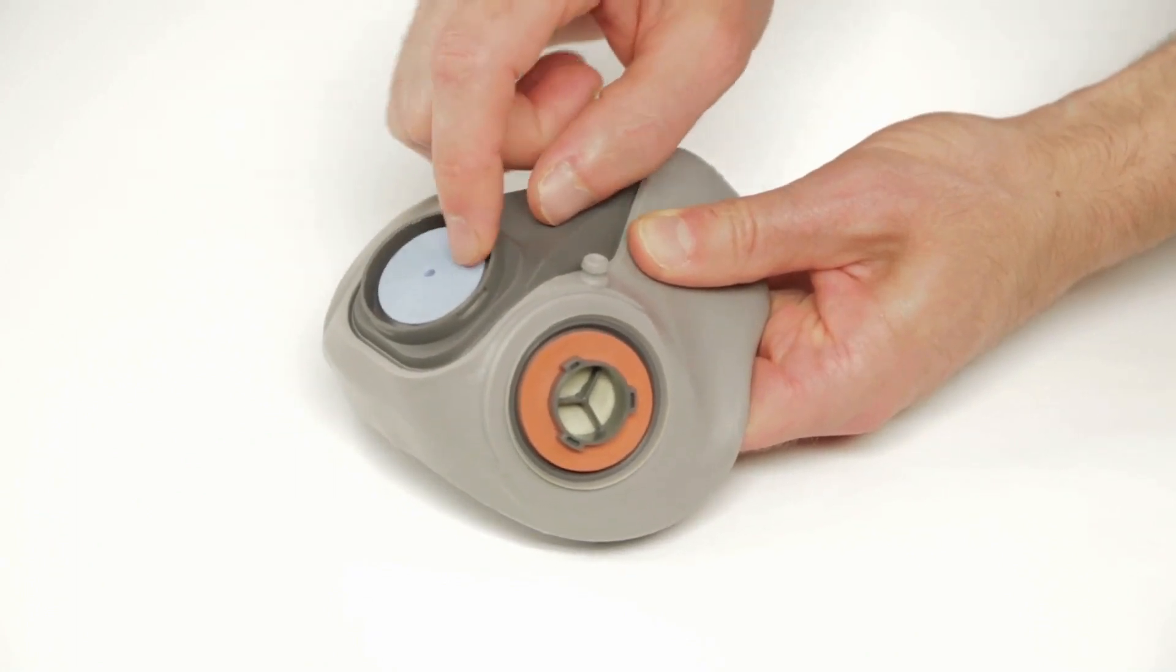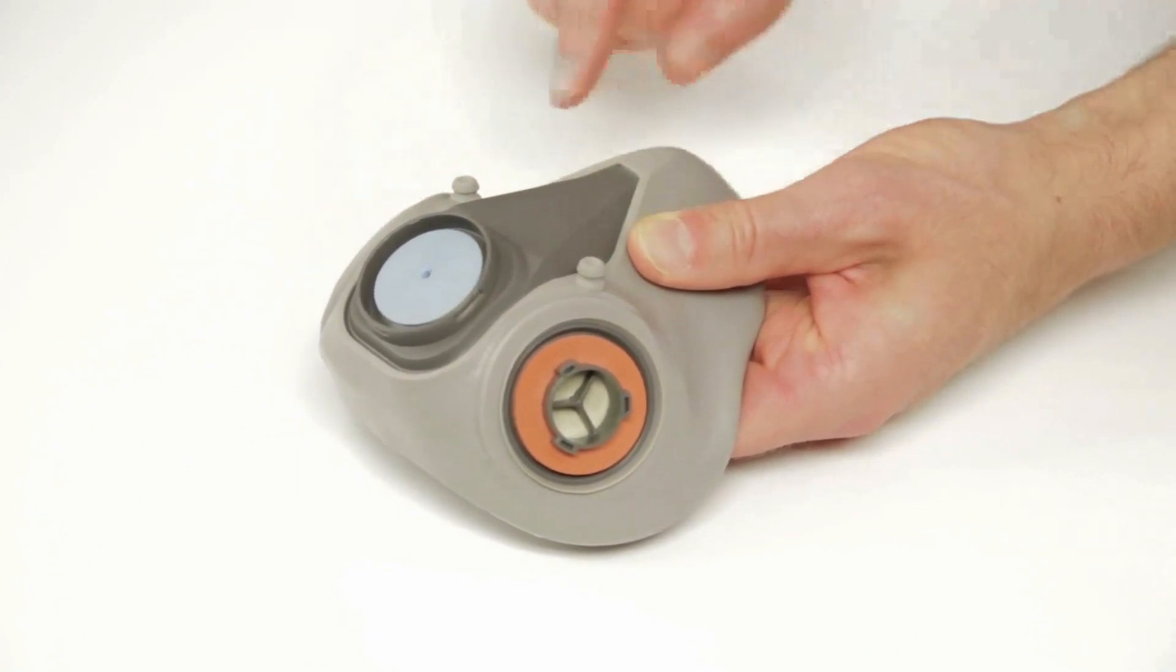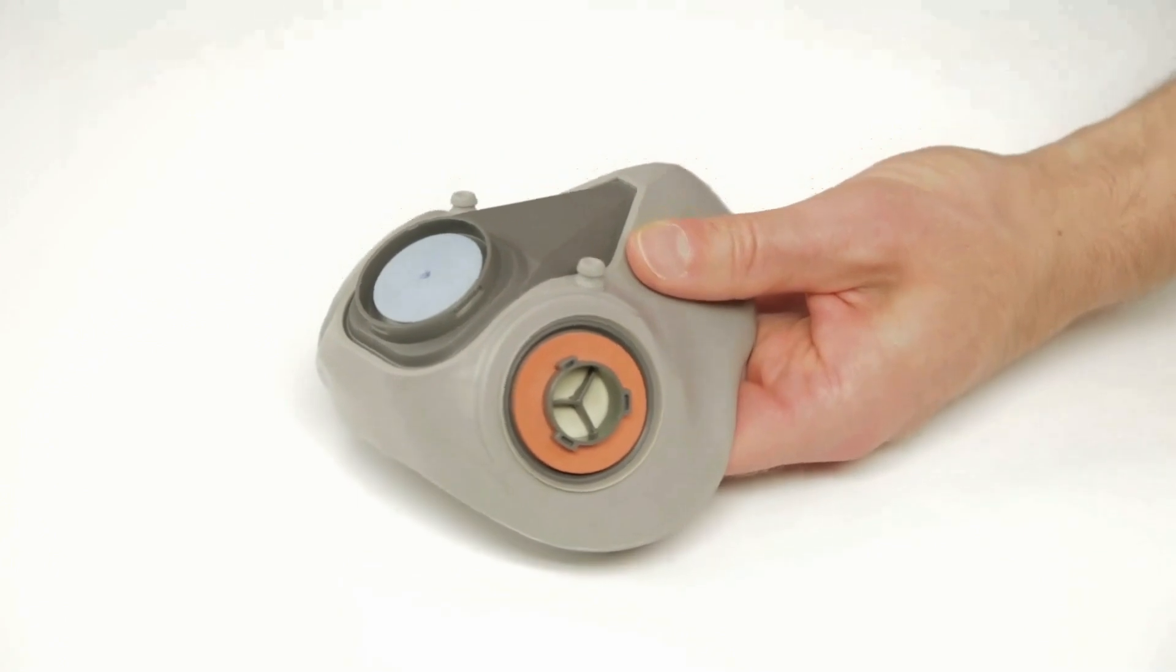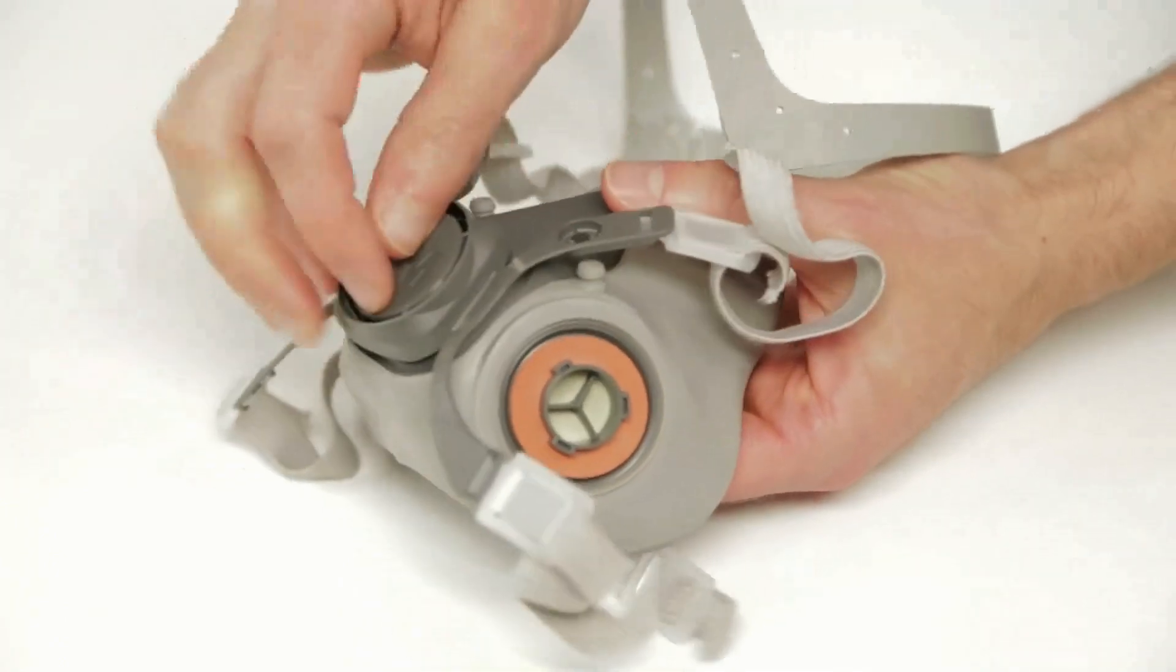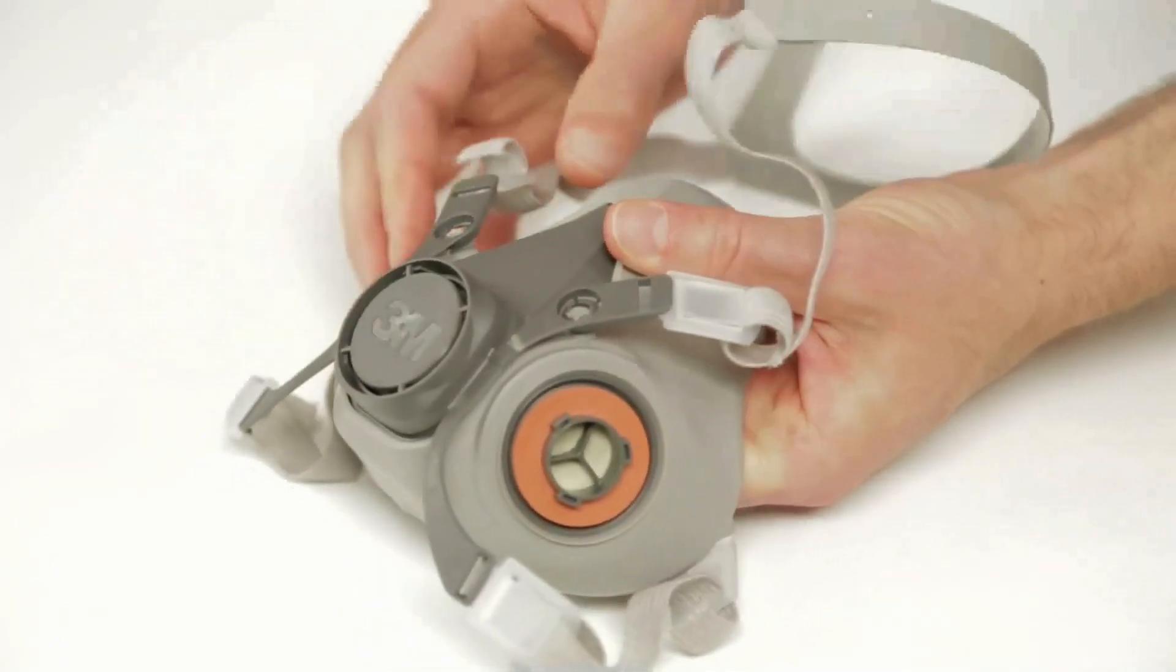If the valve does not spin freely, push on the valve again until the stem is fully seated in the center hole. Replace the respirator strap assembly as you did before.